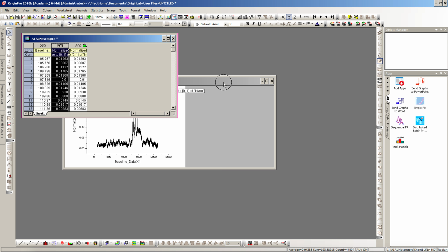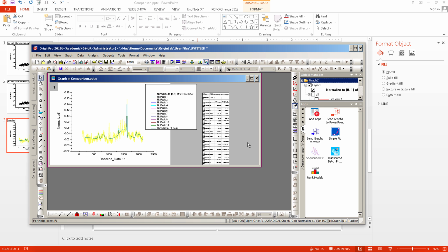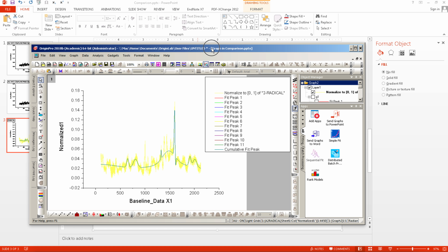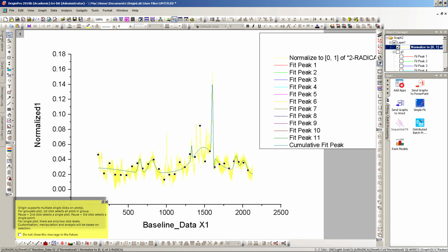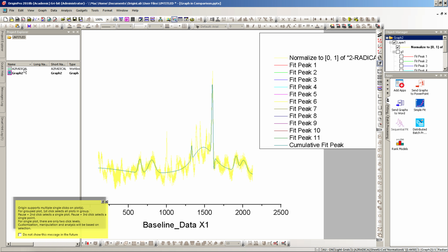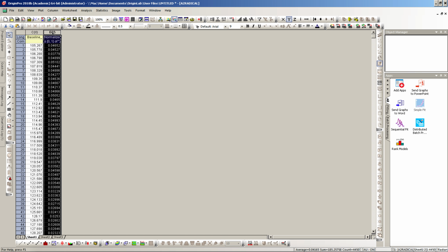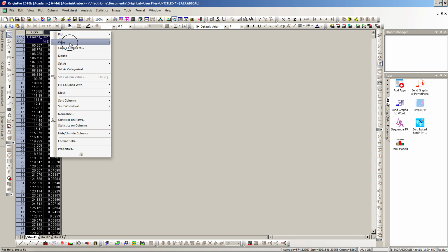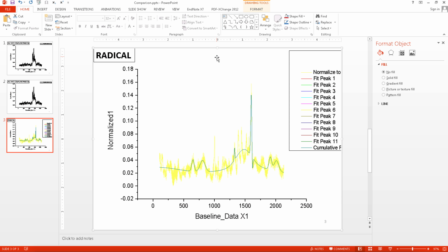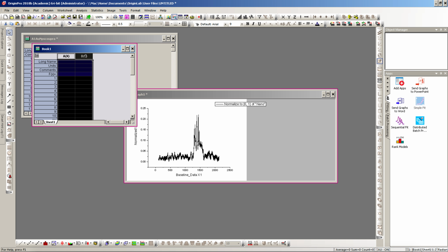Okay, so I have that one. I also see that we need this other. So I want to plot both curves in the same graph, and I say quick explorer. That one is here. It doesn't appear. So we do the same. I will go to this plot, or simply copy it, position, go to the previous one, make a new book, paste it.